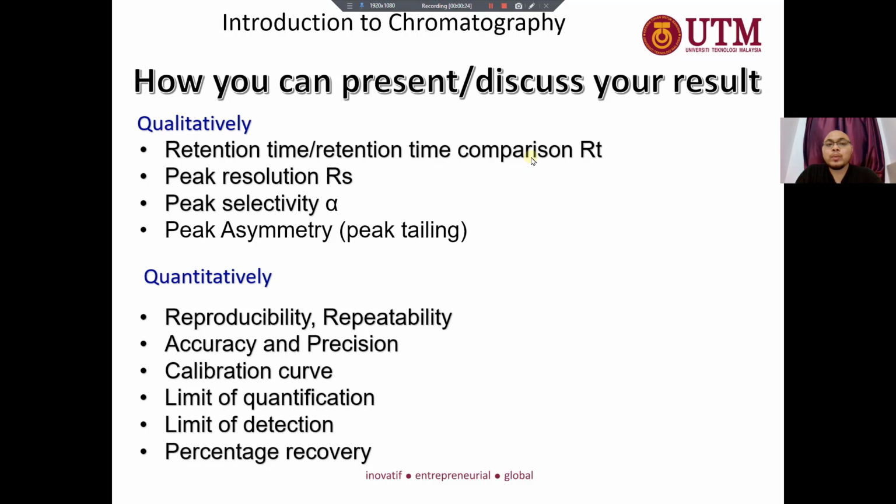Okay, the next one we will discuss is how you can present or discuss your result. If you are doing analytical analysis, instrumentation analysis, you need to be able to discuss the result based on qualitative analysis and also quantitative analysis.